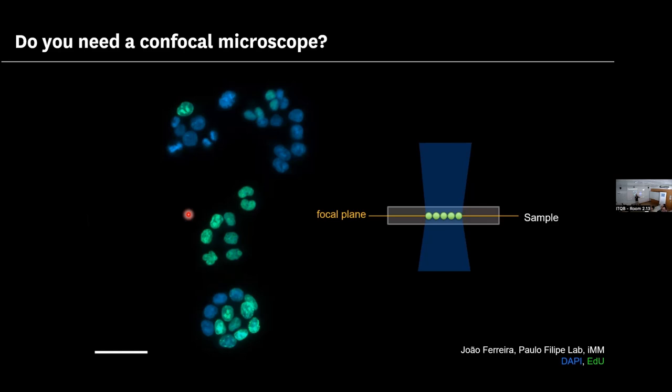This was done on the wide field microscope. Much less used than a confocal, much cheaper than a confocal, much faster than a confocal in acquiring images. So, you know, I want to use a confocal because it's the best microscope that you have in the facility? Not necessarily.